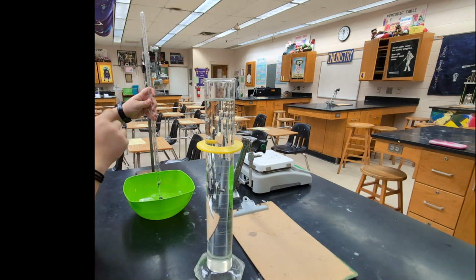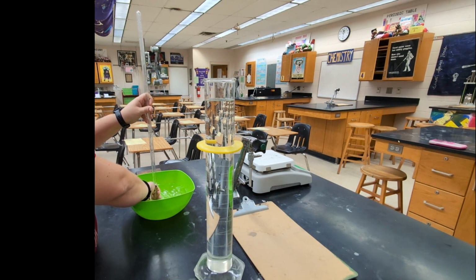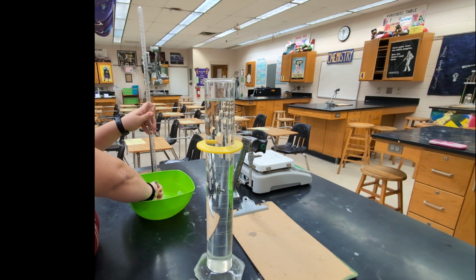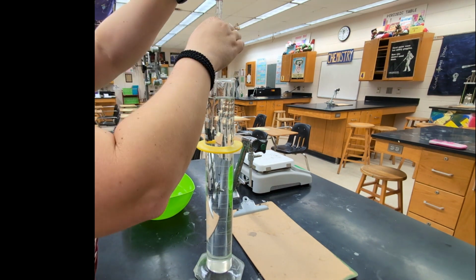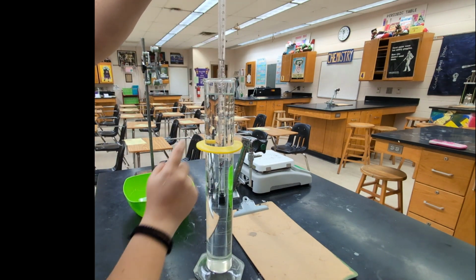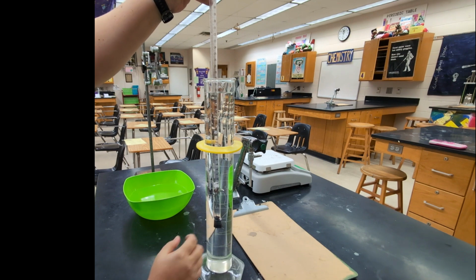Take this out. I'm going to use my thumb to stop her up. You might want to tap on it a little bit too, because there's bubbles along the outside that haven't made it to the top. And then grab it with your thumb, and we're going to transfer it up into this big graduated cylinder. And don't let go until it gets in the water. And then you want to equalize the water level inside and the water level outside, so we know what the pressure is. And once it's equal, you can record the volume in milliliters.